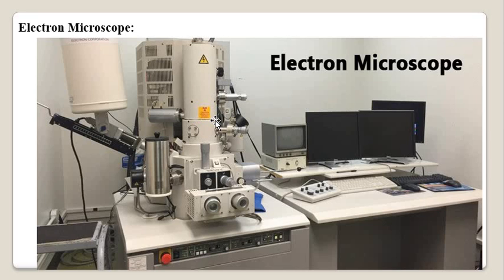Electromagnetic coils are present, and each coil has an electric wire wound on a hollow metal cylinder.